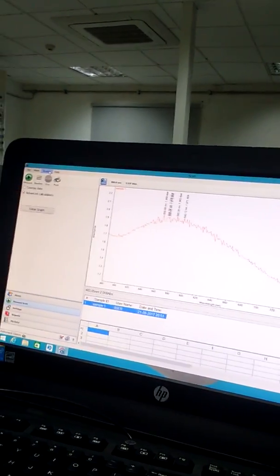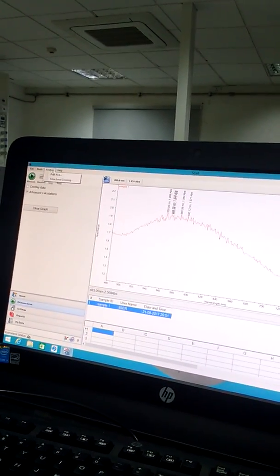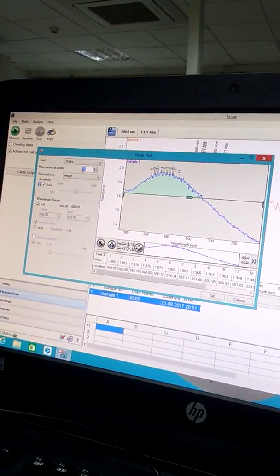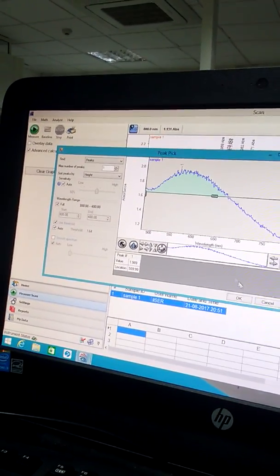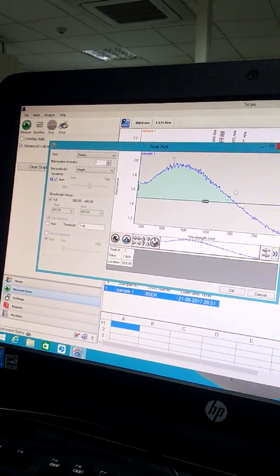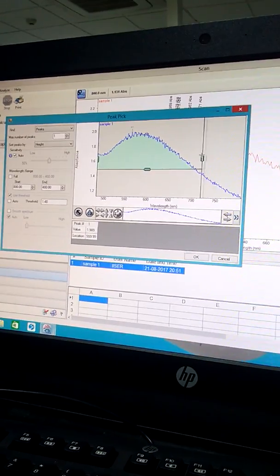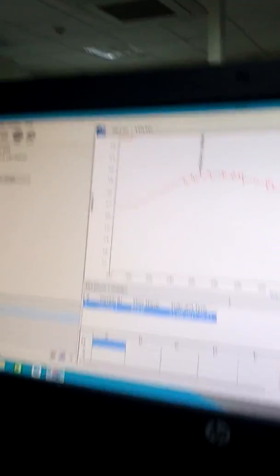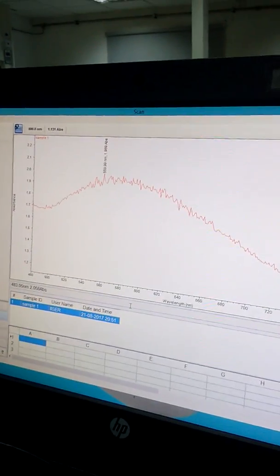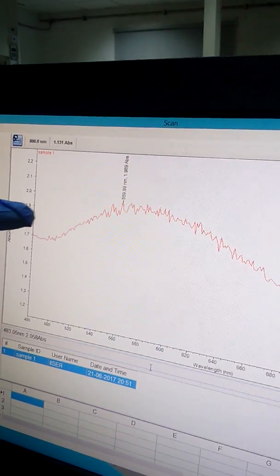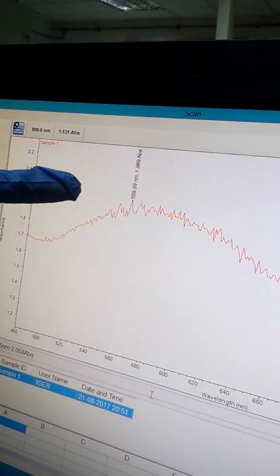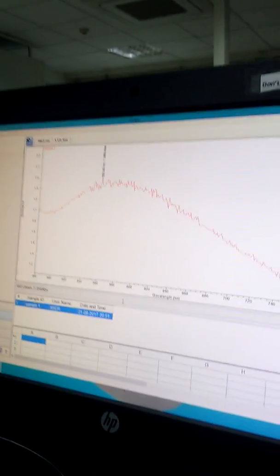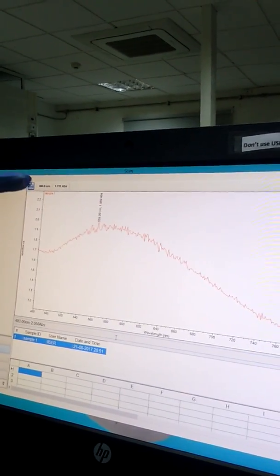Check lambda max or lambda SPR in the analysis. For this spectrum, lambda max is 559.99 nm. This is the surface plasmon resonance spectra for gold nanoparticles. Compare this lambda max value with the literature value.